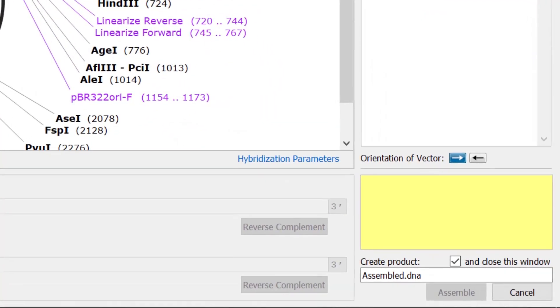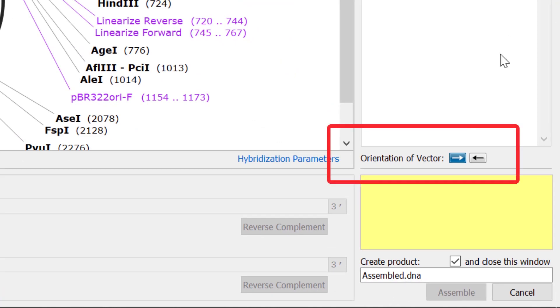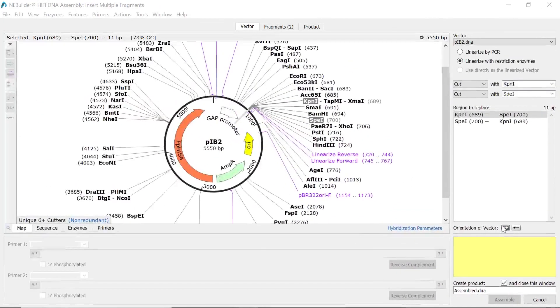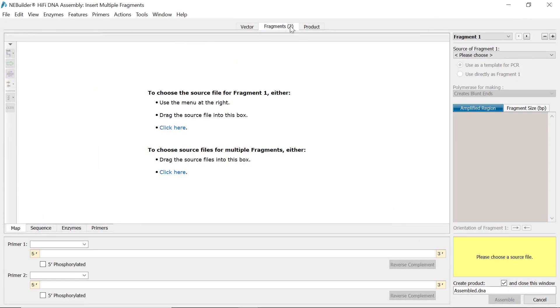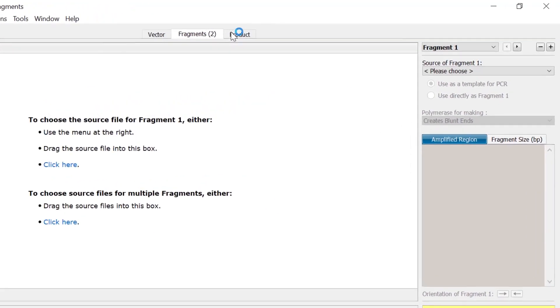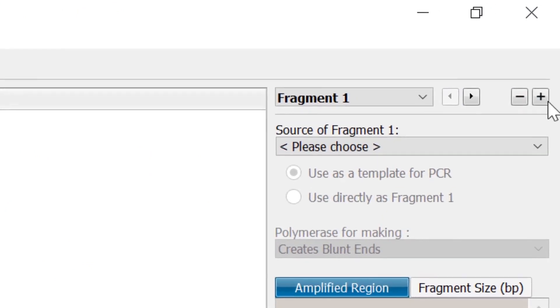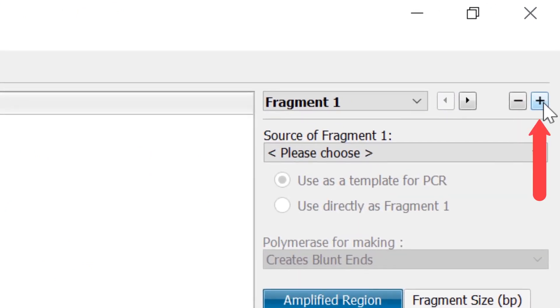If you need to change the orientation of your linearized vector, you can use the arrow buttons. Next, switch to the fragments tab to specify your fragment files. The multiple fragments window expects two fragment files by default, however you can add more by using the plus arrow at the top.